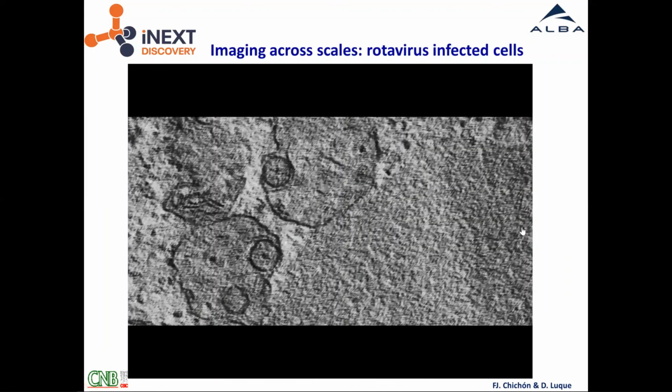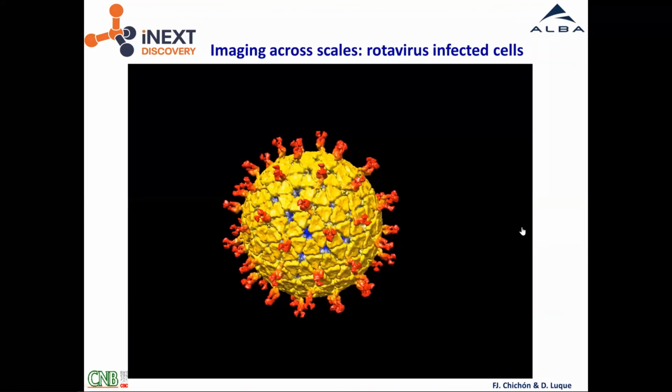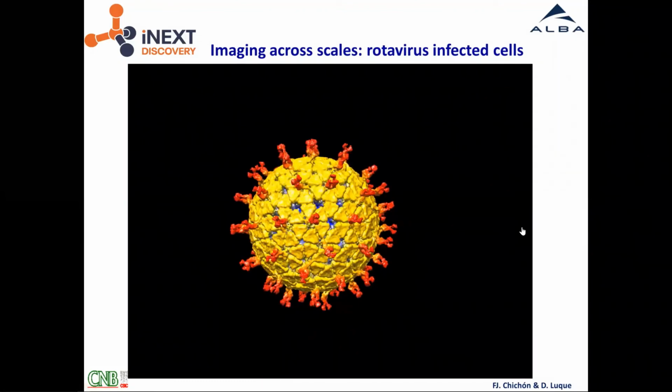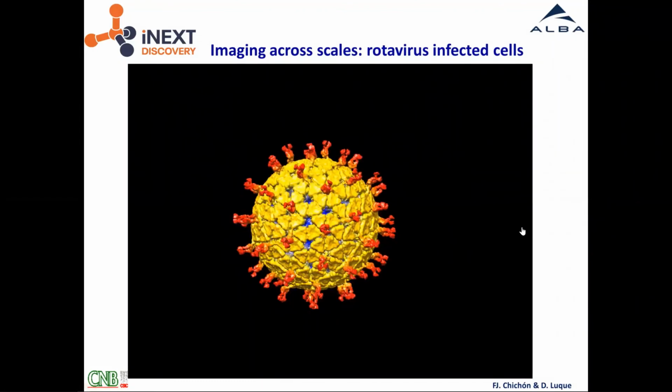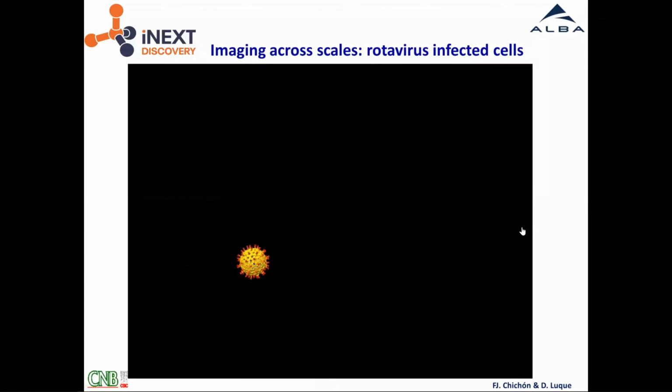And of course, you could go to single particle and put your model of your rotavirus within the full frame of this imaging across scales.